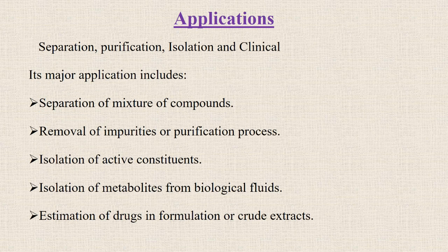Applications: separation, purification, isolation, and there are some clinical applications. Column chromatography is mainly used for the separation of mixtures of compounds and removal of impurities, the isolation of active constituents from natural products, the isolation of metabolites from biological fluid, and the estimation of drugs in formulation or any crude extracts.